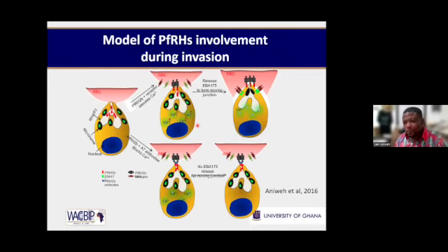So one thing, just to add a bit, on the choice of the imaging modality we use: the size of the merozoite is just 1 micron. So you can't just use any imaging system. You could see it, but you will not be able to get good information out of that. So that is why we use the confocal. But if you look at the full parasite body, that one you could just use the epifluorescent microscope or even compound microscopes to do that easily.